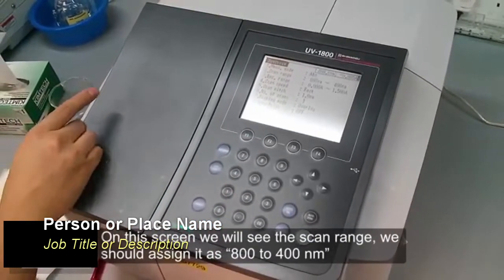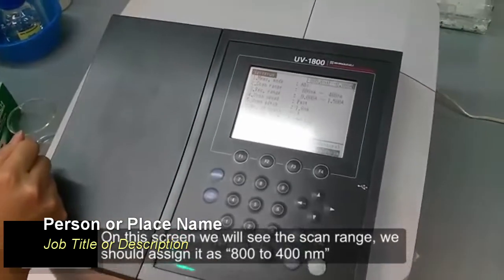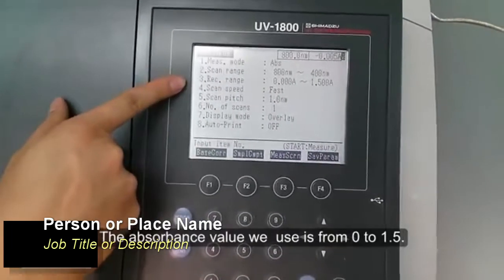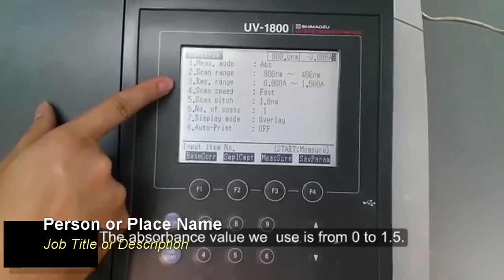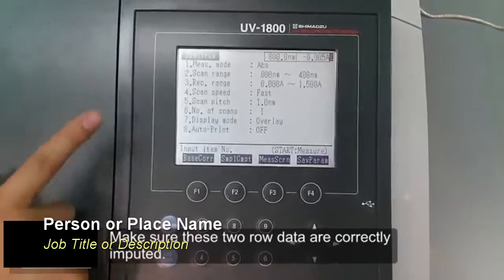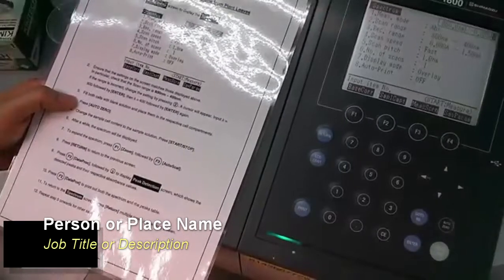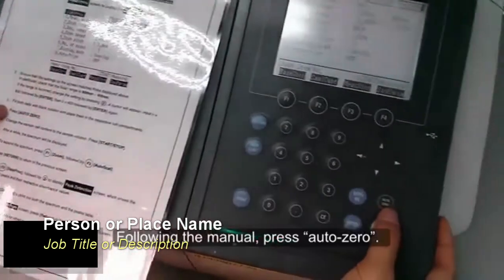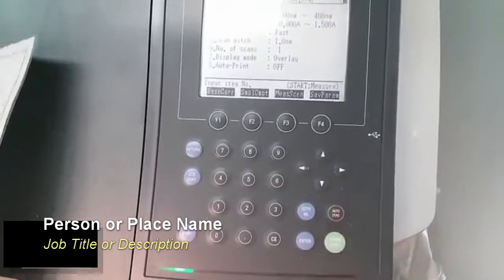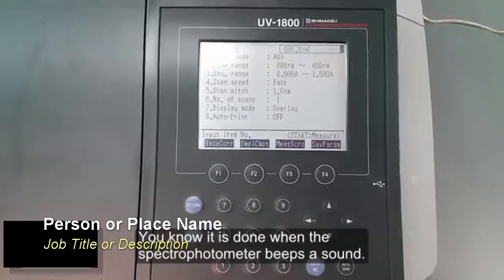On this screen, we will see the scan range and we should assign it as 800 to 400 nanometers. The absorbance value we use is from 0 to 1.5. Make sure these two rows of data are correctly inputted. Following the manual, press Auto Zero. You know it is done when the spectrophotometer beeps.